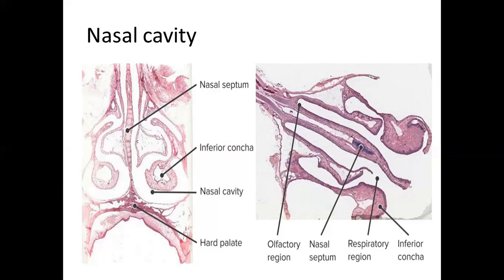After that comes the subepithelial connective tissue, which we call the lamina propria. It is richly vascularized, especially at the region of the concha and the anterior aspect of the nasal septum, which houses a large arterial plexus and venous sinuses. The lamina propria also has many seromucous glands and abundant lymphoid elements.